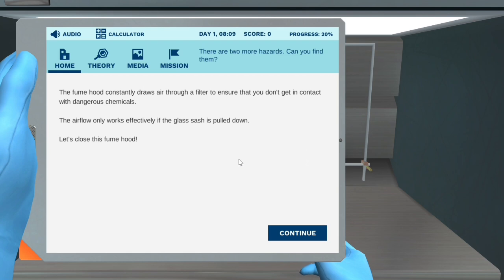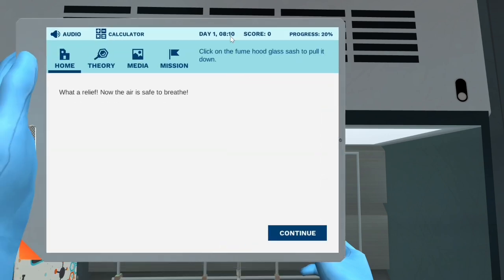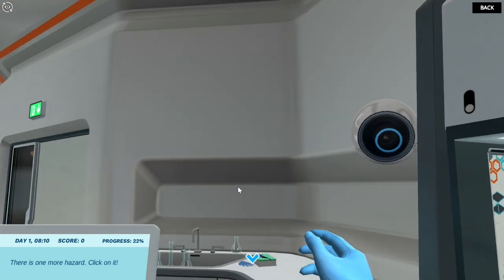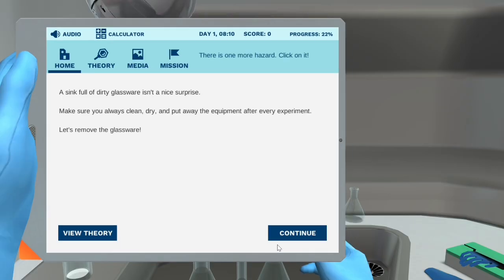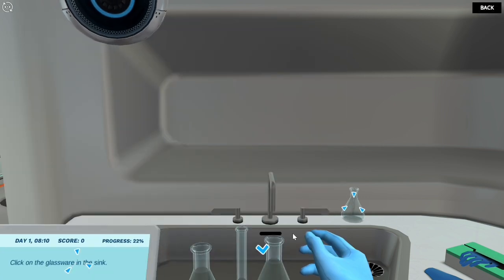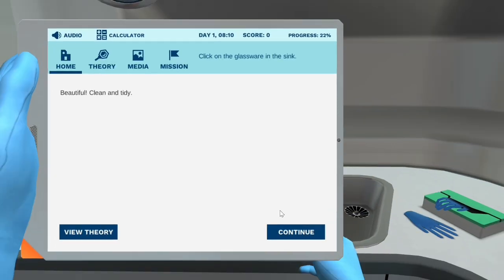The fume hood constantly draws air through a filter to ensure that you don't get in contact with dangerous chemicals. The airflow only works effectively if the glass sash is pulled down. Let's close this fume hood. What a relief! Now the air is safe to breathe. There is one more hazard — click on it. A sink full of dirty glassware isn't a nice surprise. Make sure you always clean, dry, and put away the equipment after every experiment. Let's remove the glassware. Beautiful, clean and tidy.